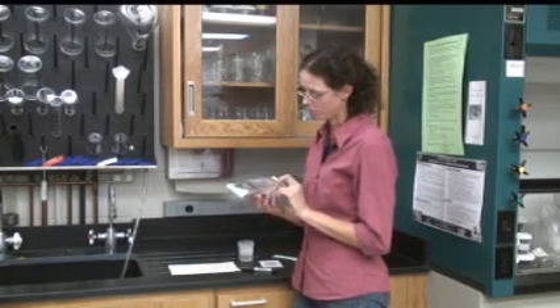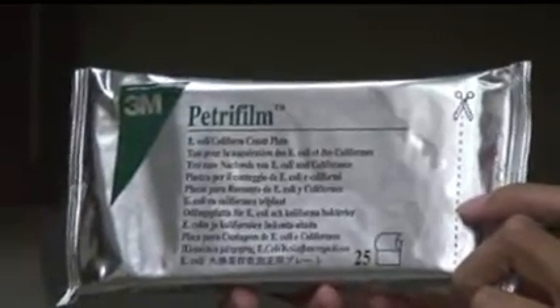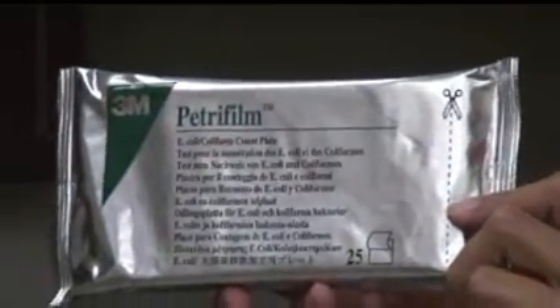The E. coli test is run using a 3M product called PetriFilm. The PetriFilm is basically a dehydrated Petri plate that selects for coliform bacteria and has color indicators for normal soil coliform bacteria and E. coli bacteria.